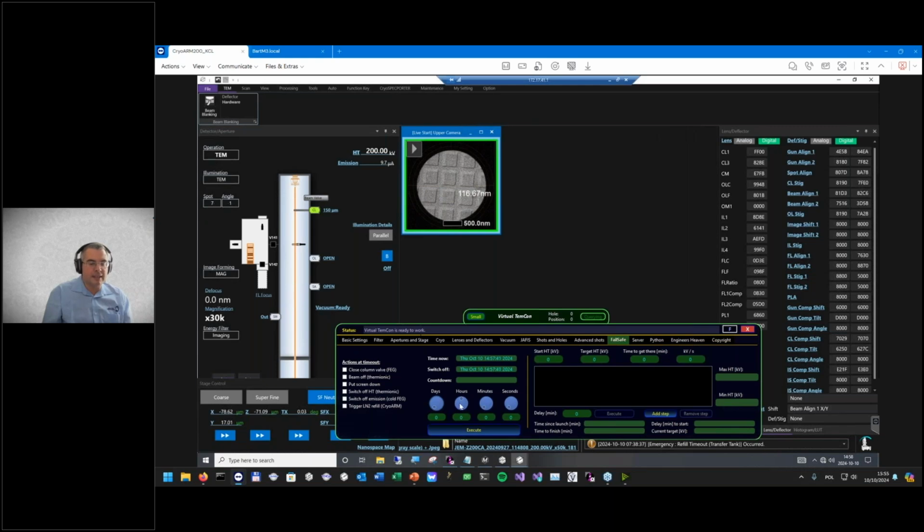Fail-safe was developed to prevent a scenario like the one discussed before, where you work remotely and suddenly your internet connection is cut off for any reason. Here in fail-safe, you can specify the number of hours, for example, let's say 1 hour, when certain emergency actions are going to be executed.